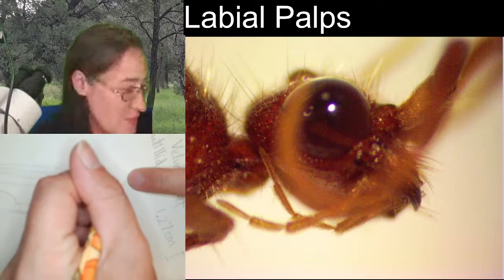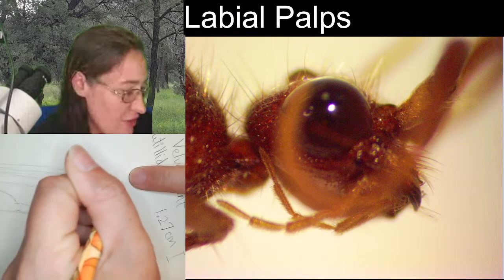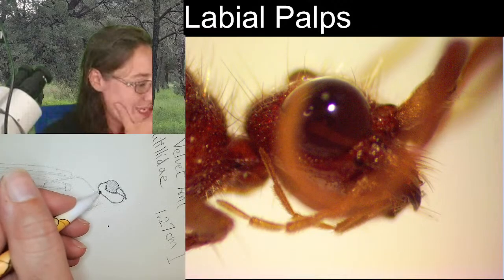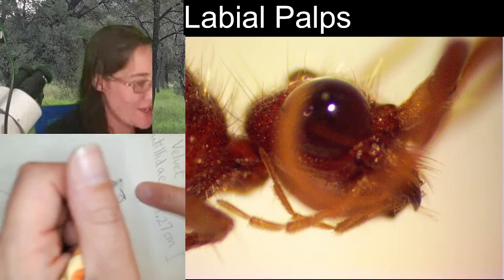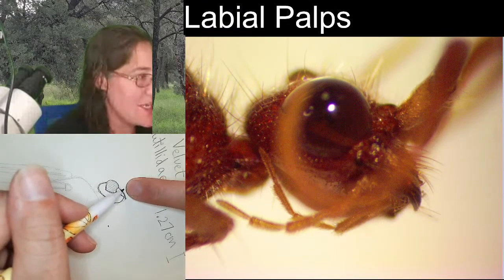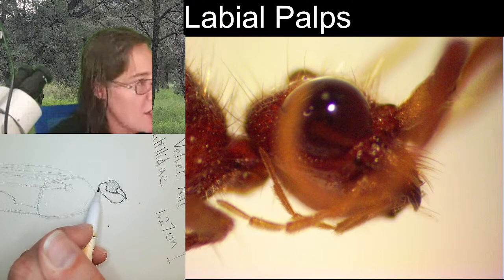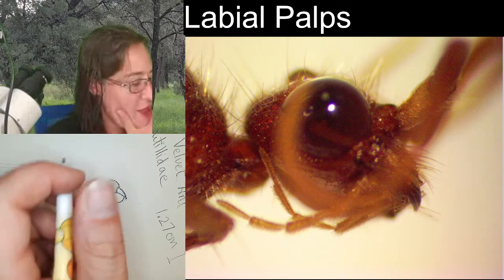I am going to crosshatch within the compound eye because, as you know, we need all those little ommatidia, those little individual lenses. Now, I'm thinking it looks kind of funny, but I will fix it. Because we've got the mandible here, but we need this region up here that's above. So if you take this arch and follow it through, you will still have some head region that we have to add.